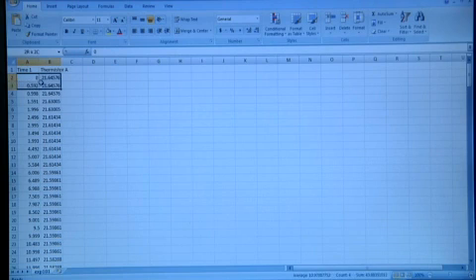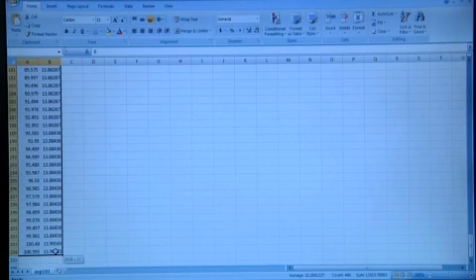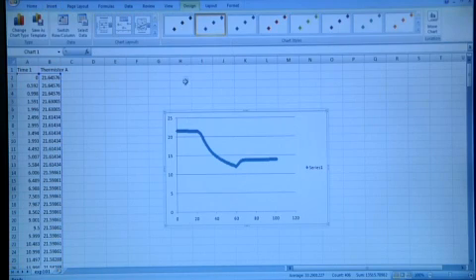And we can actually, in a normal Excel way, click and drag around the values that we have in the 100 seconds to choose our data that we're going to put into a graph, and we can insert a graph. So let's build a scatter graph, and there you have it. And again, once you're in Excel, you can do whatever you want with building the graph, changing the scales, formatting it, and so on.